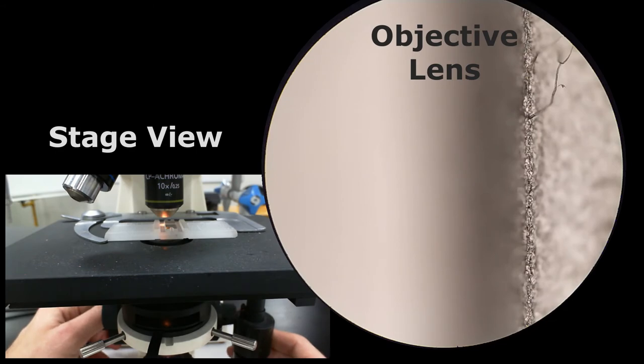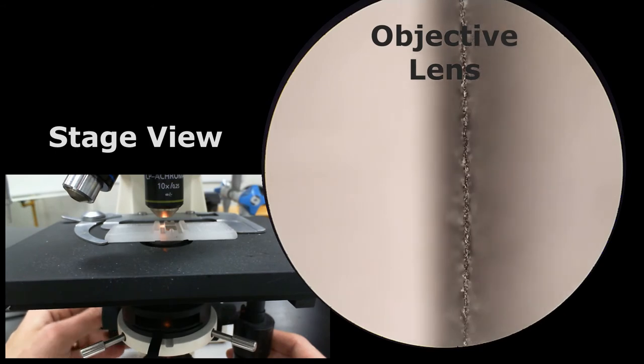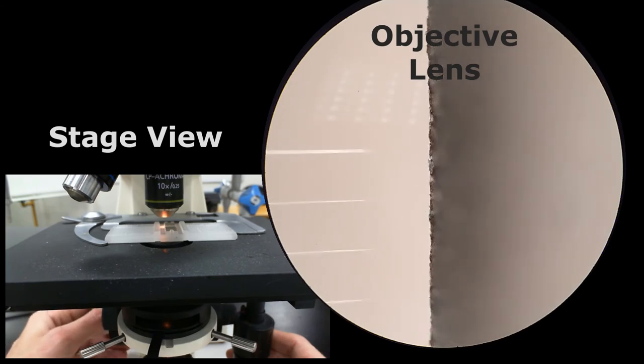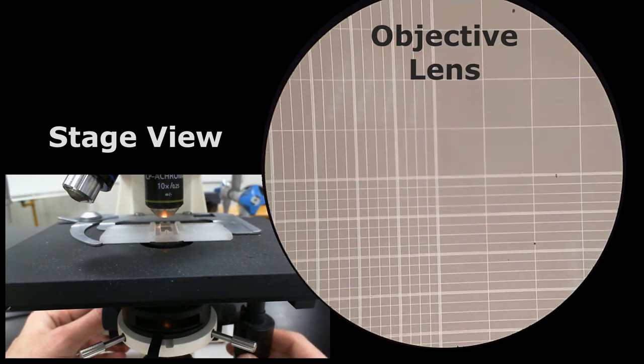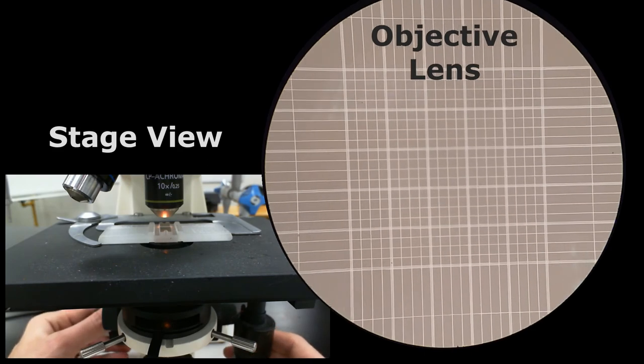So I need to be looking for things that are going to be sharp for me. The sharp edges should be on the left and not on the right. This is why I'm turning and turning until I see the part that's in focus going towards the left more and more, as I'm getting closer to having it in focus at the right level. And here it is. I can actually see the lines of the counting chamber right now. And here we go. This is the middle of the counting chamber.